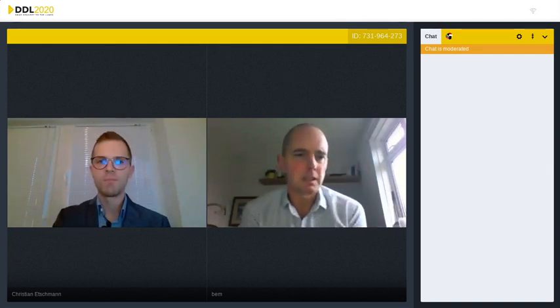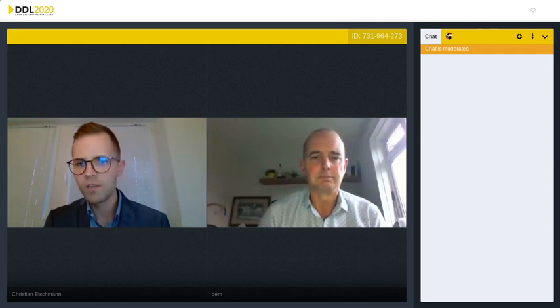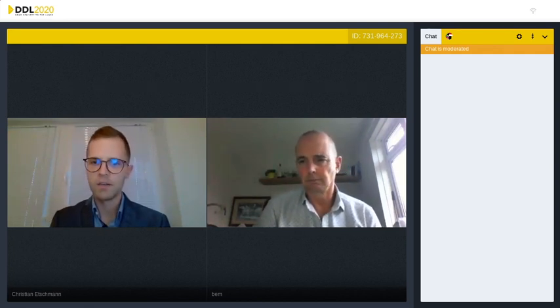Okay. Yeah. I found a study where they investigated the inhalation of rifampicin and isoniazid, and they carried out the experiments with 20 milligram of rifampicin. So I would say that the optimum is reached when a fine particle dose of 20 milligrams of rifampicin can be generated. So the optimum is already reached when I use 3 capsules filled with 20 milligram of formulation.